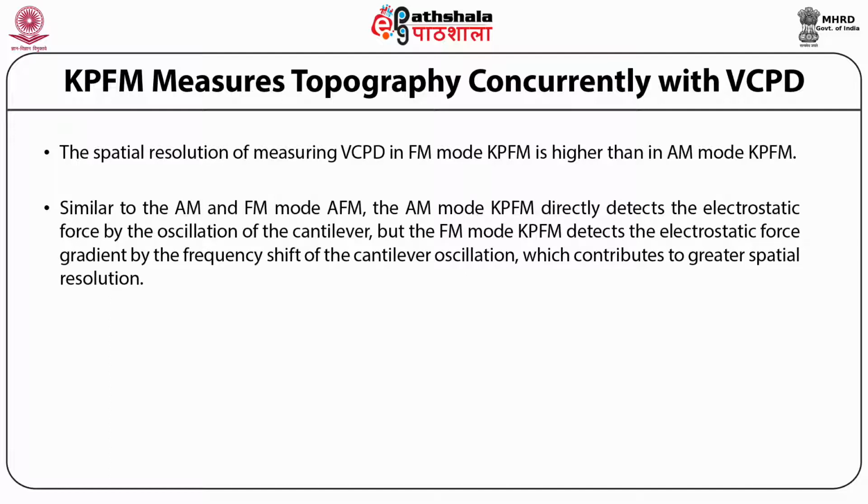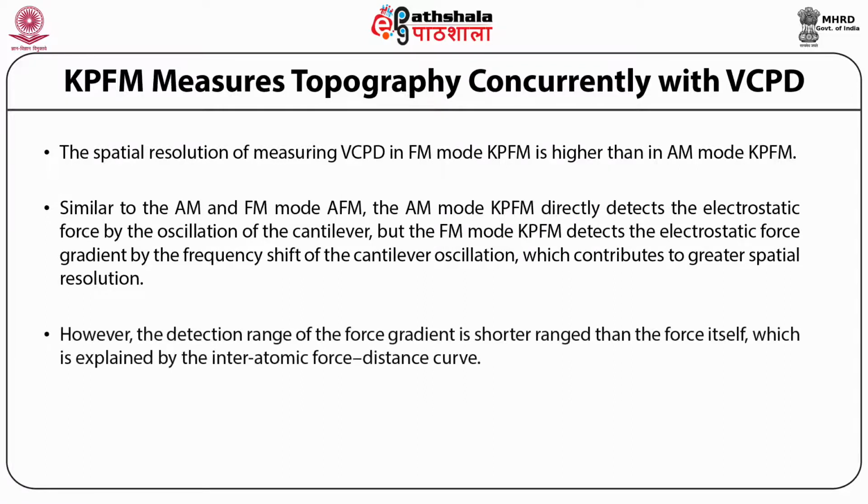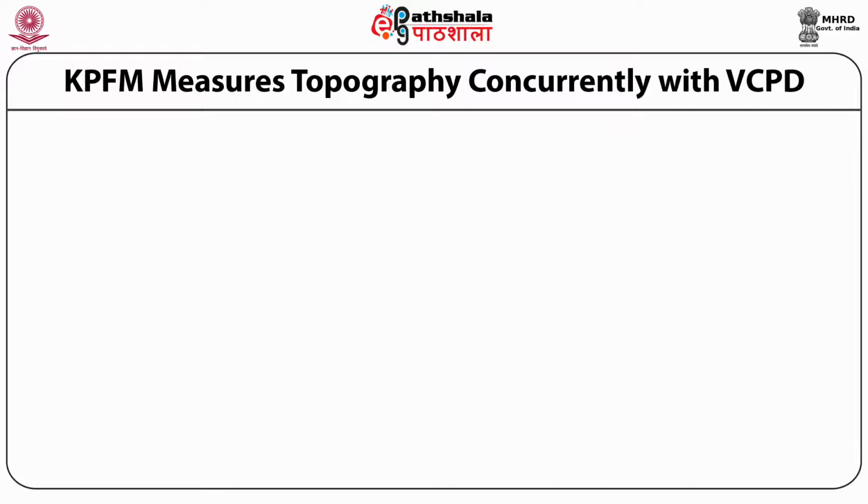mode KPFM detects the electrostatic force gradient by the frequency shift of the cantilever oscillation, which contributes to greater spatial resolution. However, the detection range of the force gradient is shorter range than the force itself, which is explained by the interatomic force distance curve.